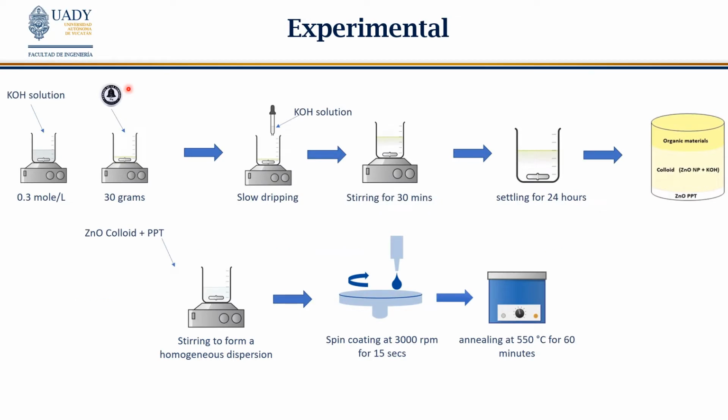So it shows a commercial skincare product which is called La Pomada de la Campana. It contains zinc oxide along with organic materials. And then we performed the following procedure.